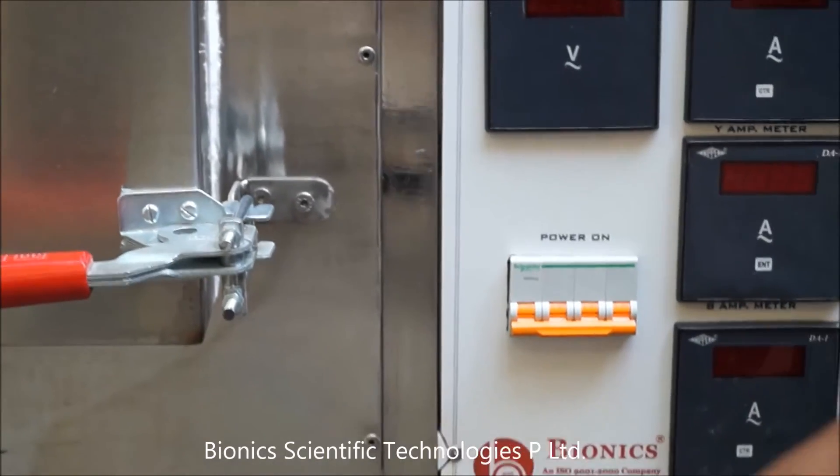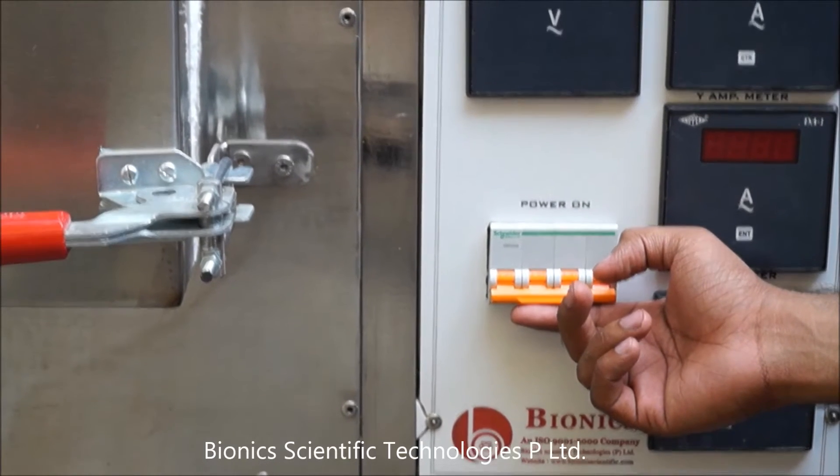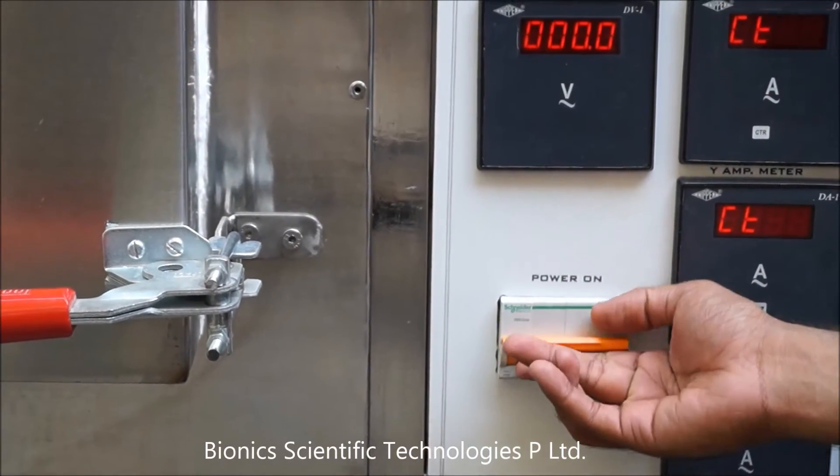This is the main MCB and on/off switch. You can just lift it like this and your unit will be on.